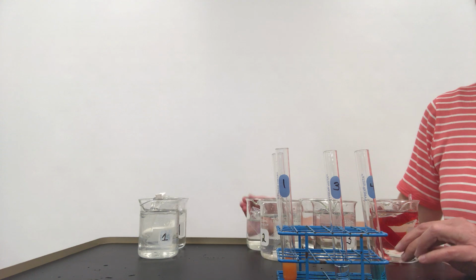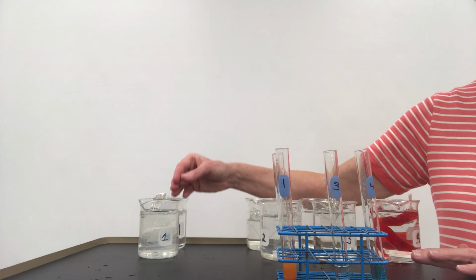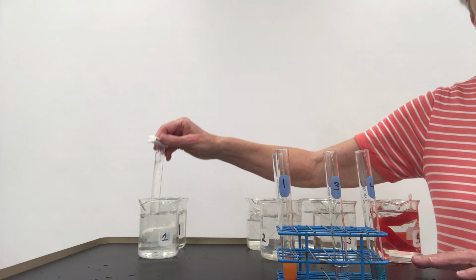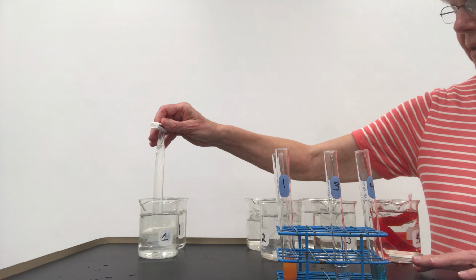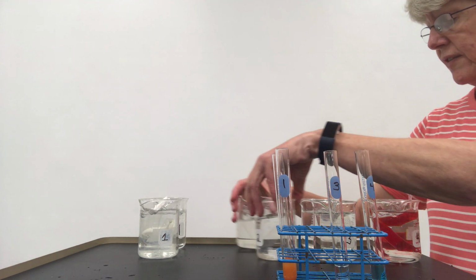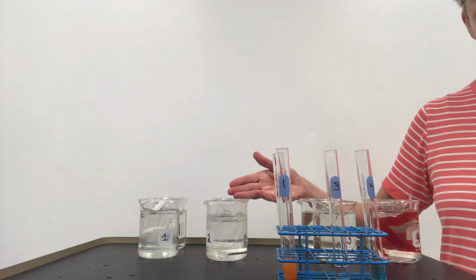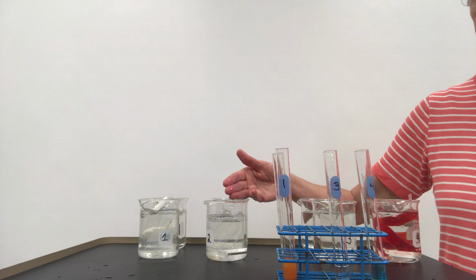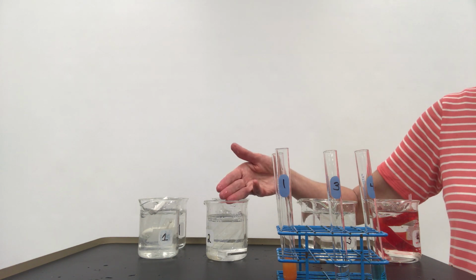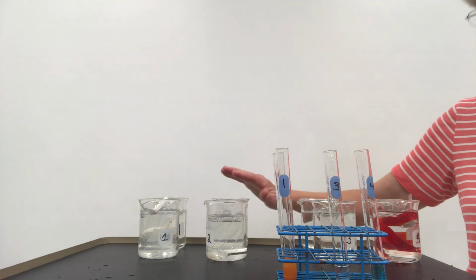But when we talk about the water moving from high to low across that selectively permeable membrane, the sac, or the cell membrane, we call that osmosis, or we can say that the water osmosed into the sac. Now, for the number 2 setup, it was the same thing in the sac and outside the sac. Both had sugar, the glucose, 40% glucose. So there's no need to test because it should be positive for both of these. So we're not going to even test those.